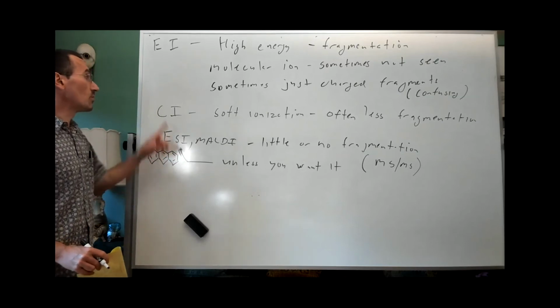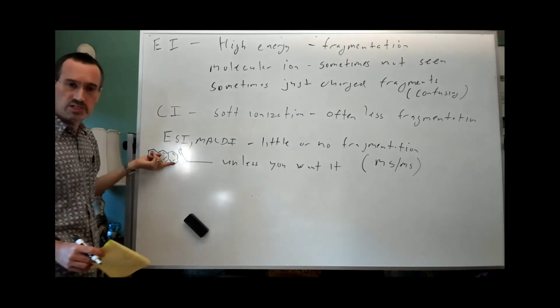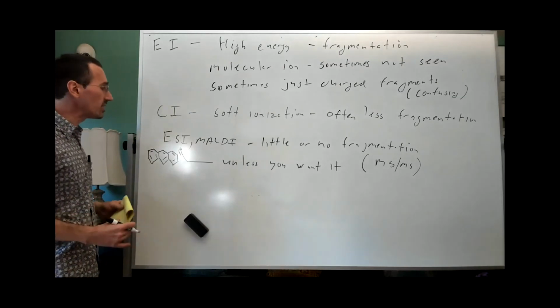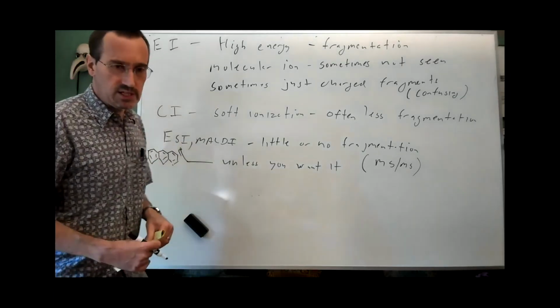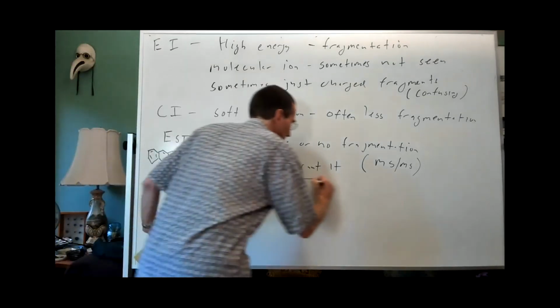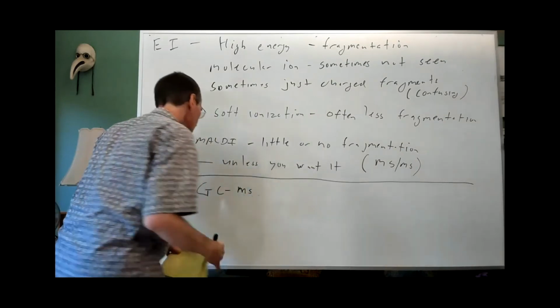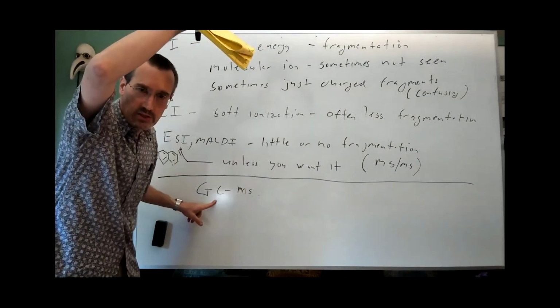A molecule like anthracene would work very well with EI, or possibly CI, and part of that is the molecule can be roasted without decomposing it, whereas if you roast a peptide or roast strychnine, you're probably going to decompose it. But those are good ionization techniques for it. Also, if you're doing a small molecule project, you might end up using a technique like GC mass spec, and I'll mention a couple of so-called hyphenated mass spec techniques. So who's done gas chromatography in the course of your research?